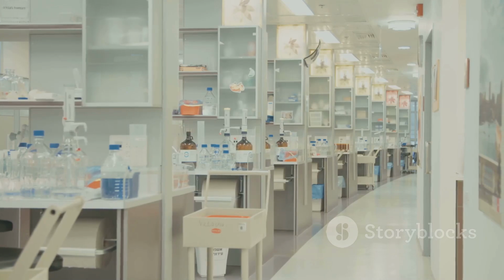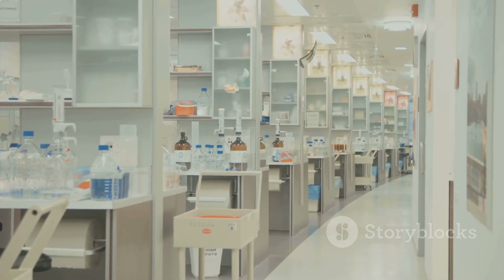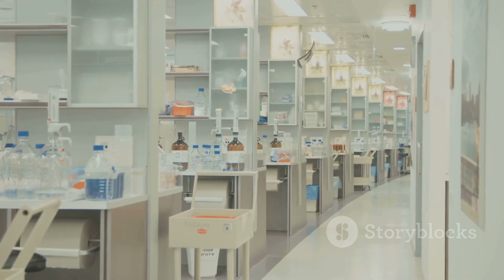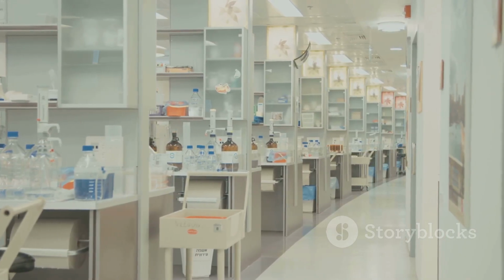Remember, pick the right BSC for your work. It's not just about following the rules, it's about keeping yourself, your colleagues, and your science safe. Stay sharp in the lab, and never underestimate the power of the right equipment.